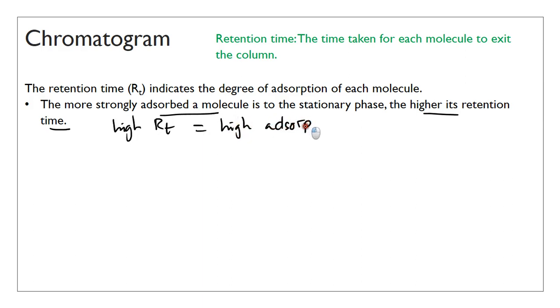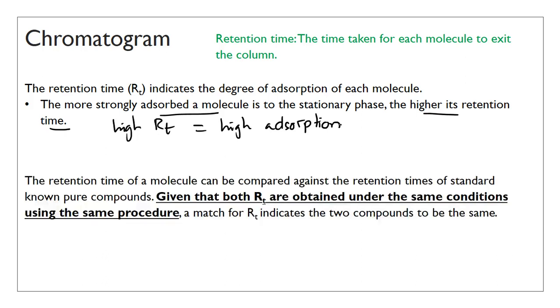So the difference between HPLC and paper chromatography is mainly that in the case of paper, you keep the time the same and then you measure the distance traveled. Whereas in the case of HPLC, you keep the distance traveled the same and you measure the time. And in both cases, the thing that affects your result is actually the speed, which I mentioned in the principle video.